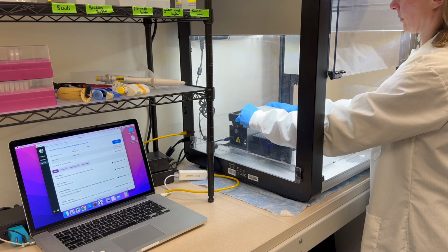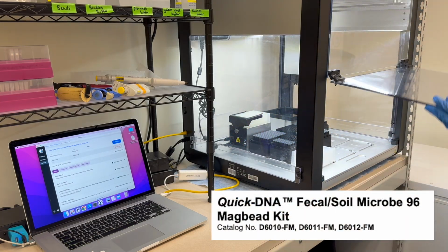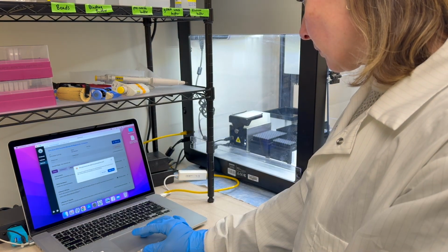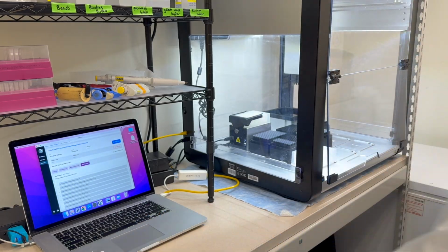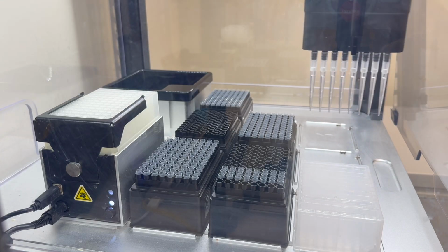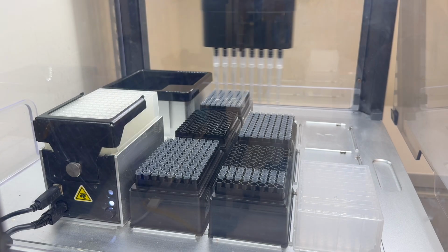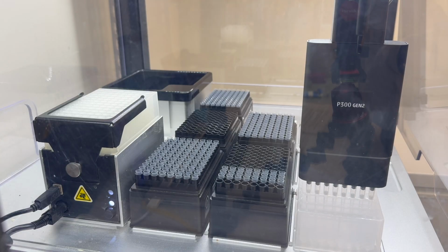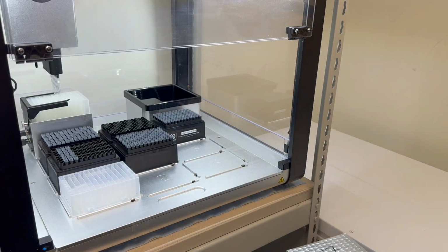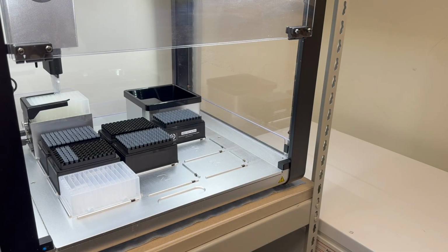Our plate of samples then goes into our Opentrons robot, and this is going to run a modified version of the Quick DNA fecal soil extraction kit from Zymo Research. Now, you don't need a robot to do your extractions. Zymo makes some great kits that use tubes that you can do by hand, but the reason we use the robot is because it minimizes human error in these extractions when we're handling large numbers of samples at once. It takes about 3.5 hours to do the full extraction. Once we've finished, we're going to store our DNA in the freezer until we're ready to do our PCR.